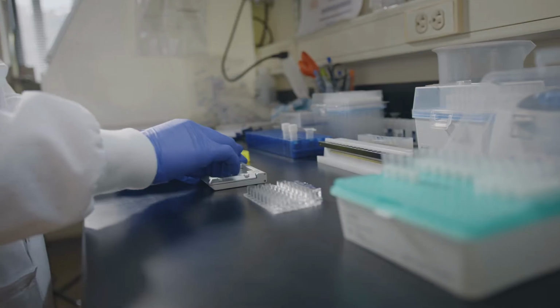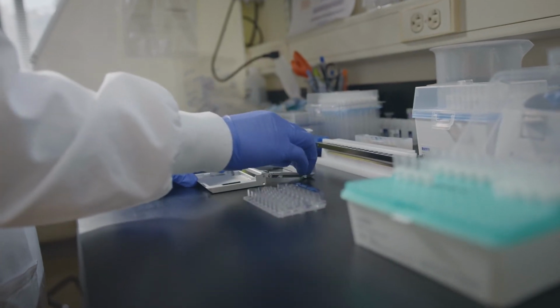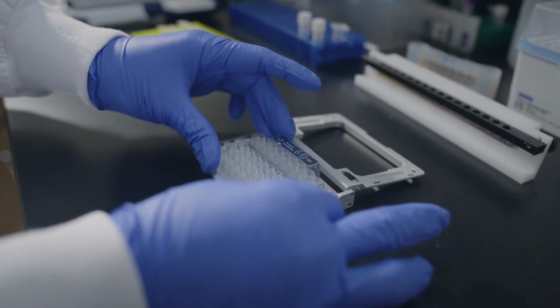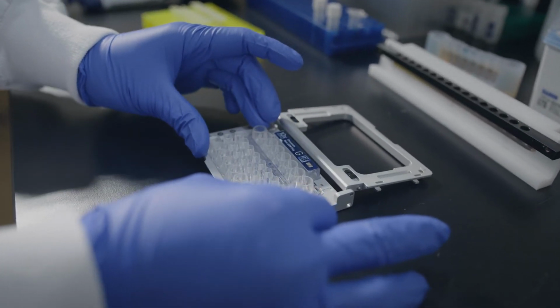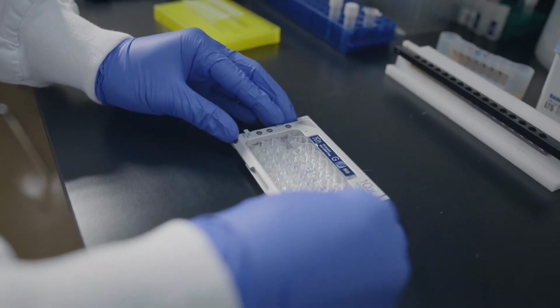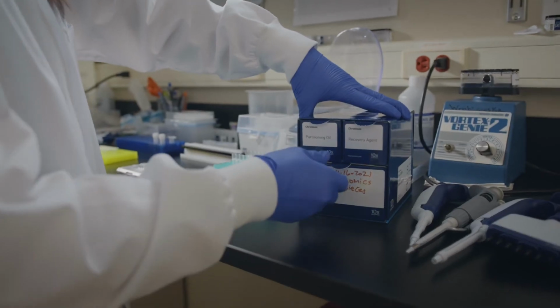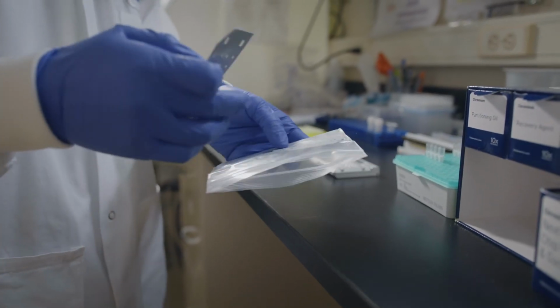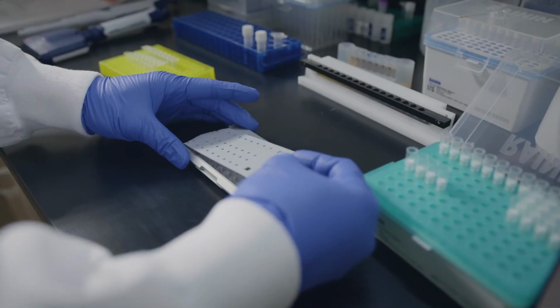When you look at a whole group of cells, you know that the genes are there, but you don't know: is it the tumor cells or the T cells or the B cells that are expressing those genes? But when you do single cell sequencing, you know exactly which cell is expressing those genes. Scientists then can use that information to do targeted therapy and to fight diseases.